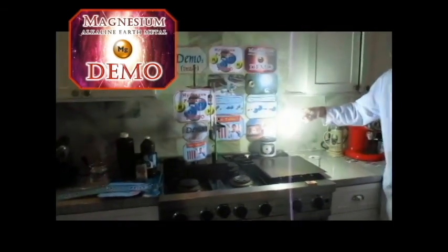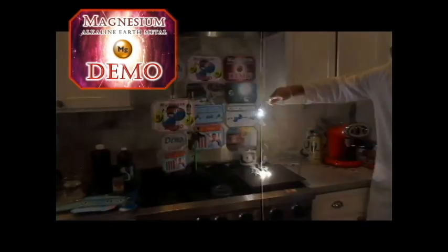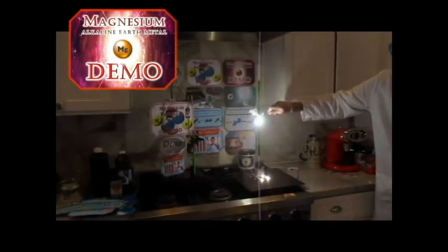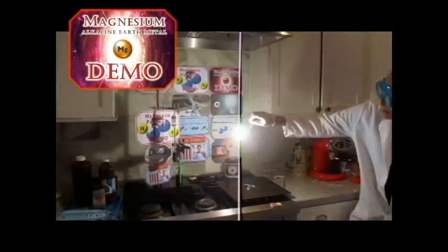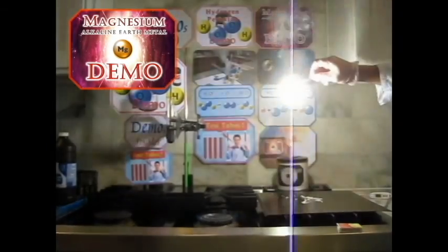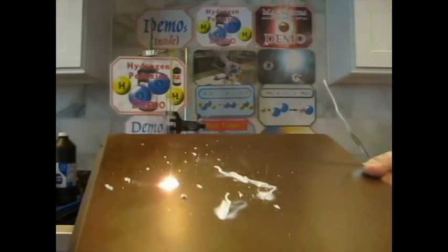Okay, I'm going to have to turn on the expeller fan. Okay, this is a really, really good one. It's burning brightly, maybe because of that extra oxygen that is here. This one's going for a long time, a really long time, right? Okay, that is a great reaction, a great example of an alkaline earth metal demo.